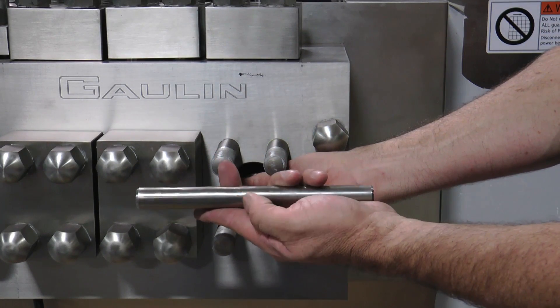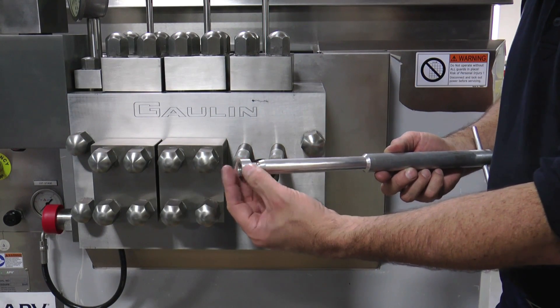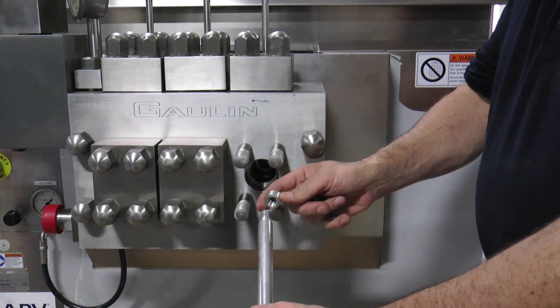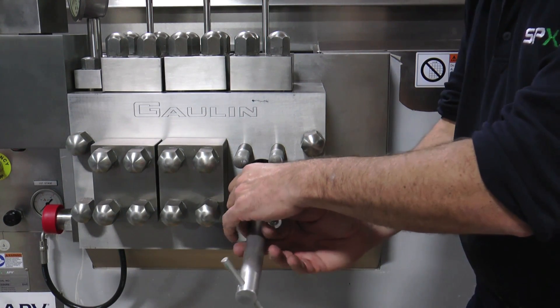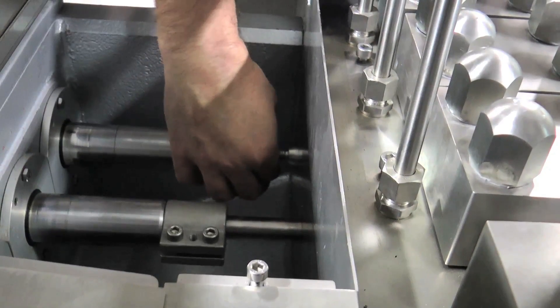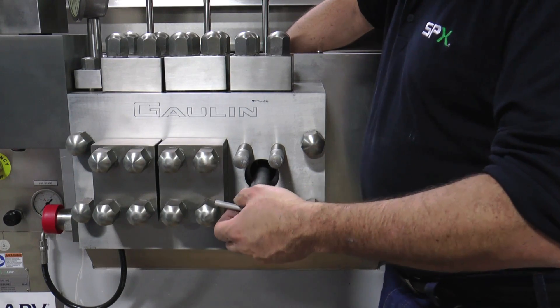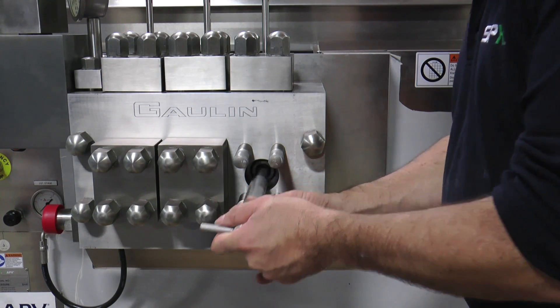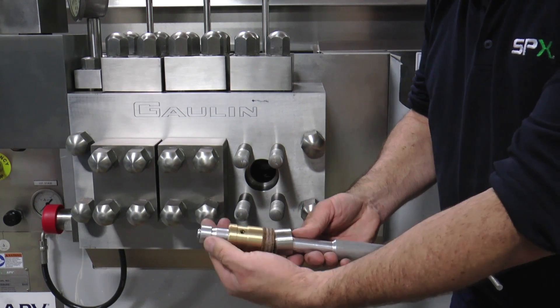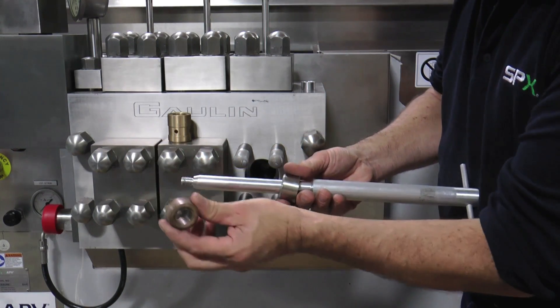Check the plunger for any scoring or irregular, uneven surfaces. A special packing removal tool is now required to remove the packing. Reinstall the nut on the back side after the tool is through the packing arrangement. Tighten the packing removal tool into the nut and carefully pull forward to remove the complete packing arrangement, which includes the packing ring, the V-seals, as well as the brass packing adjustment ring.